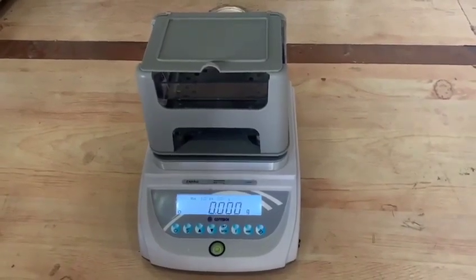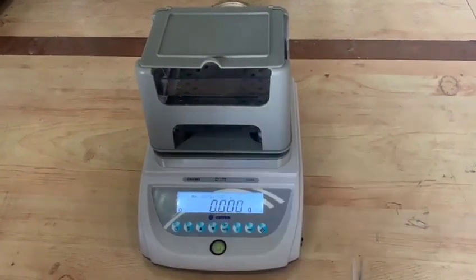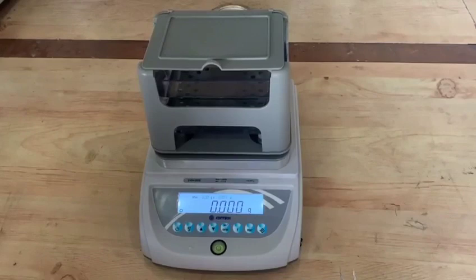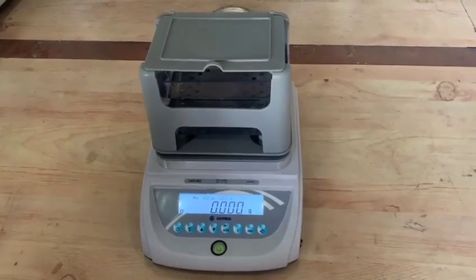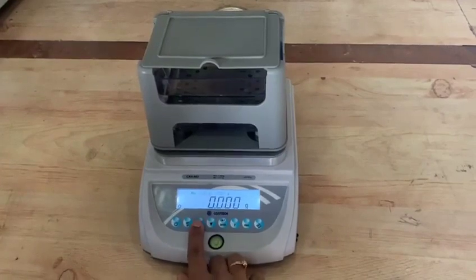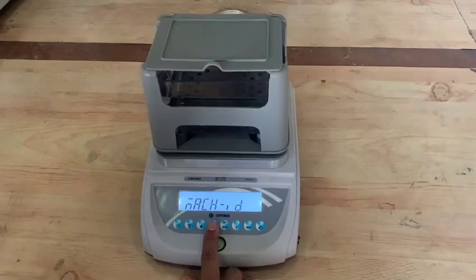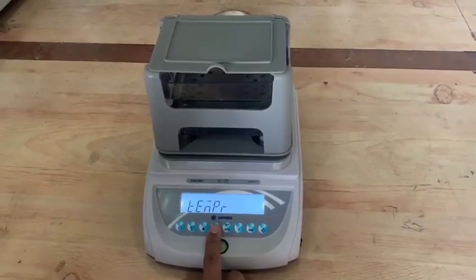The system consists of a high precision electronic balance and kit with software for measuring purity of gold. For obtaining accurate gold purity measurement, the copper-silver ratio in the gold sample should be set in the balance. Color of the metal can be used to determine the copper-silver ratio.